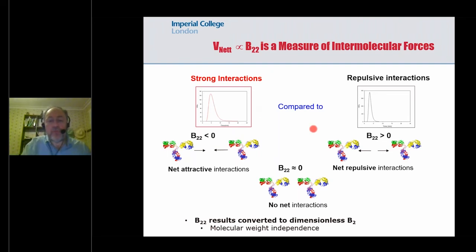And we can also sometimes have repulsive interactions. If we have a repulsive interaction, the peaks come out a bit quicker. So what we're doing in the experiment is we're comparing the elution time at different solution conditions. So what's the retention at pH 3, 4, 5, 6, 7? As I change the solution in the mobile phase that passes through the column, I'm going to look to see, are the chromatograms coming out faster or slower?